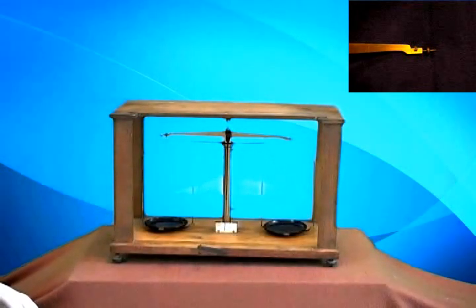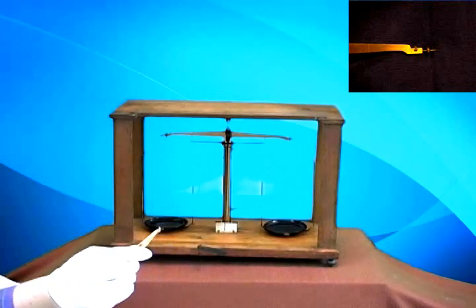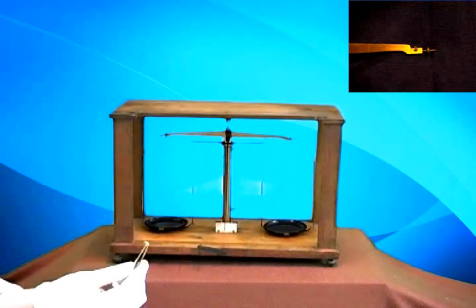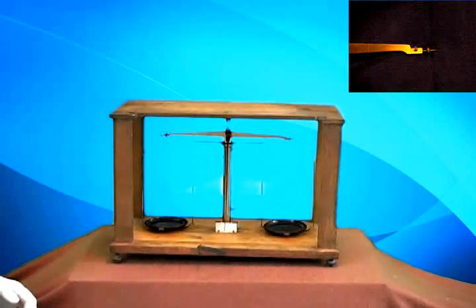Some of the more modern ones, and I don't know if Dalton had them this small or not, some of the more modern ones had tiny little pieces of material that weighed 5 milligrams, 10 milligrams, 20 milligrams, 50 milligrams, 100 milligrams, and 200 milligrams. There were even some that very possibly weighed different amounts, but this is what I have.